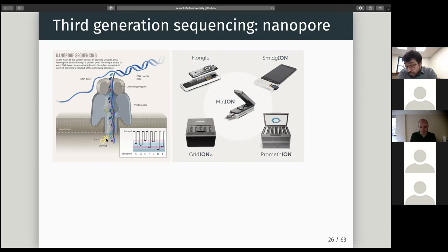Again, this has changed recently, but you can also generate extremely long sequences. I told you PacBio gets about 50 KB. Here we're talking about megabase sequences. It's hard, they're rare, but you can. Actually, I think the world record is 2 megabases, and that was only one read. I mean, you can assemble anything with that.